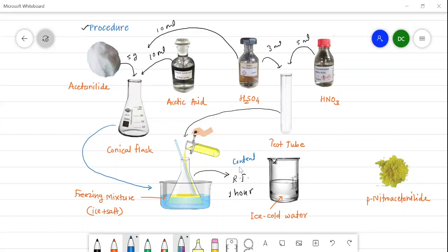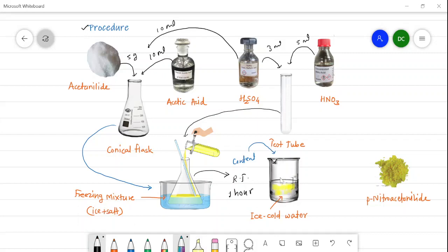After 1 hour, the reaction mixture in the conical flask is transferred to the ice-cold water in the beaker. There is a formation of a yellow solid in this water — it is nothing but para-nitroacetanilide. After pouring the content into the ice-cold water, we get the yellow solid. This solid is filtered, then washed with water and dried. After drying, we get the crude para-nitroacetanilide, and suppose the weight of this crude product is about 5.4 grams.